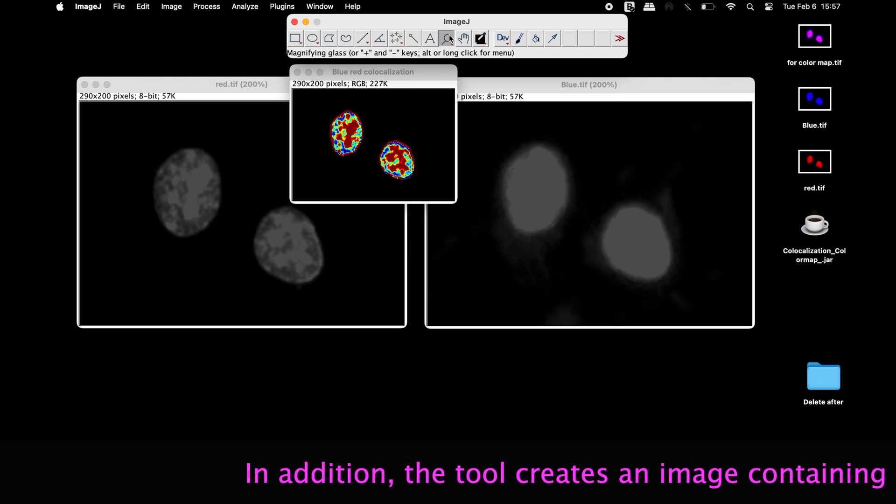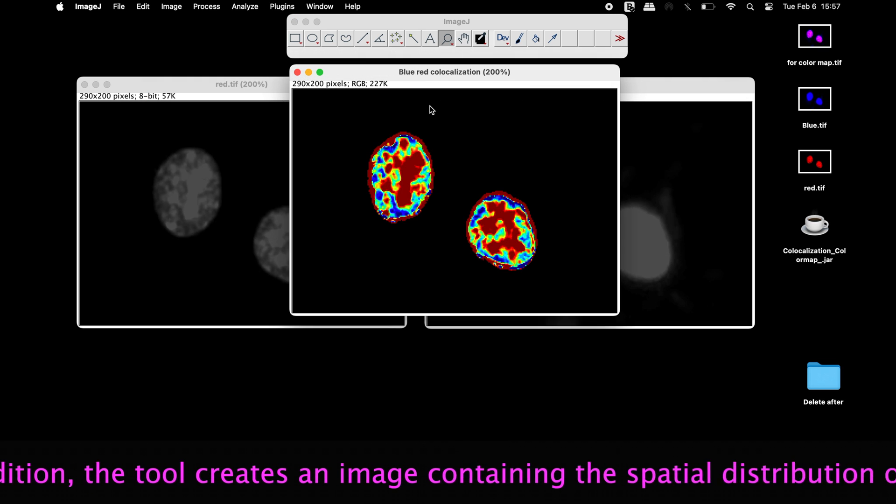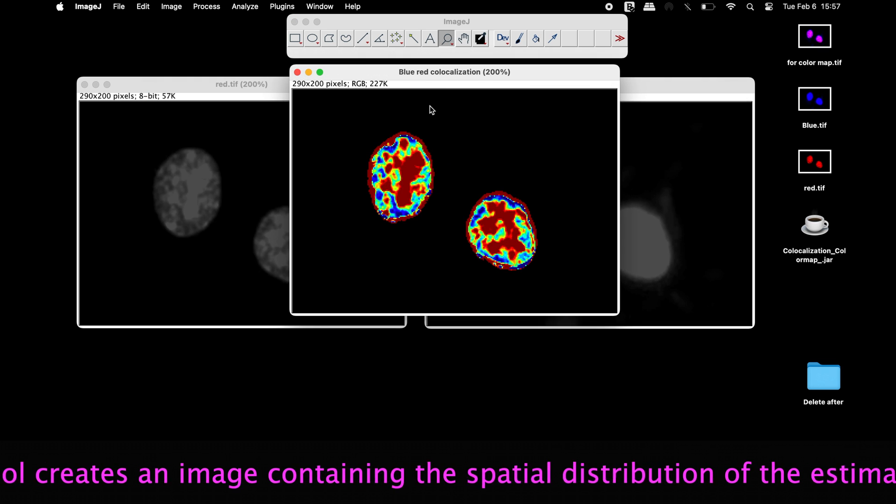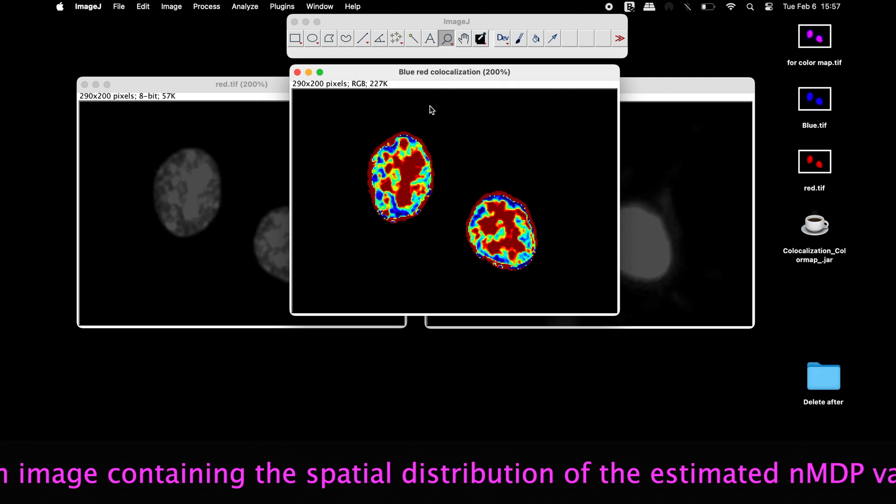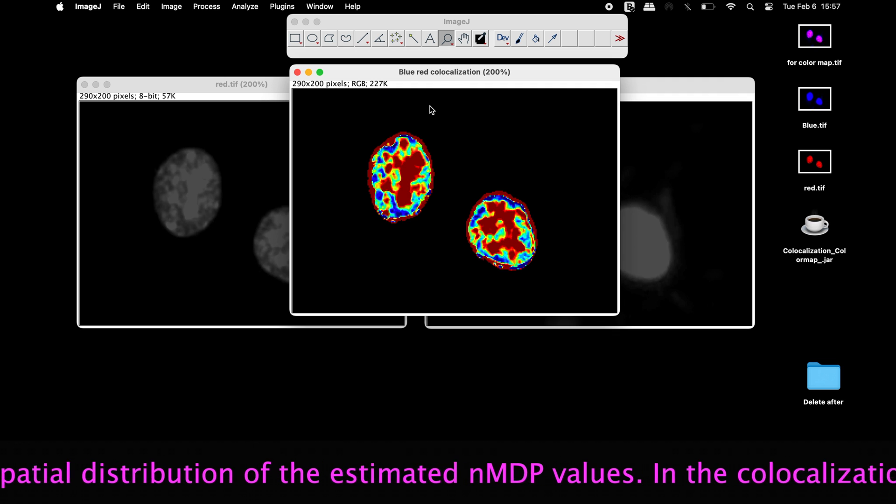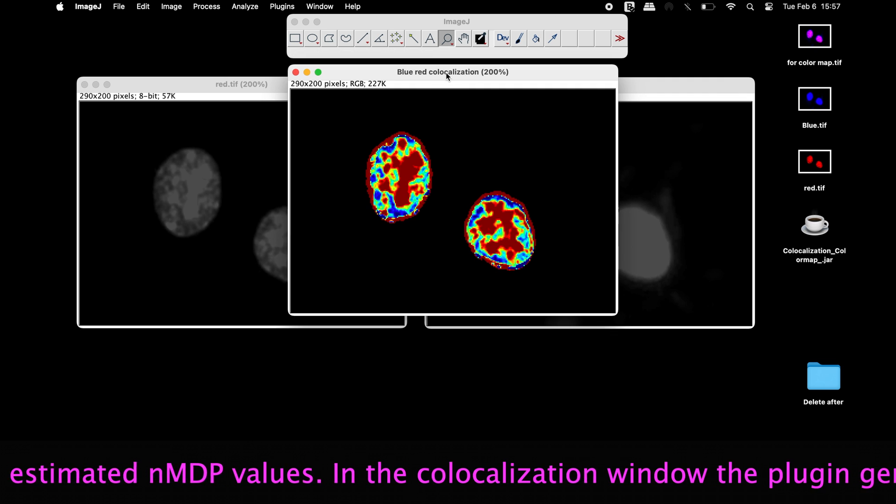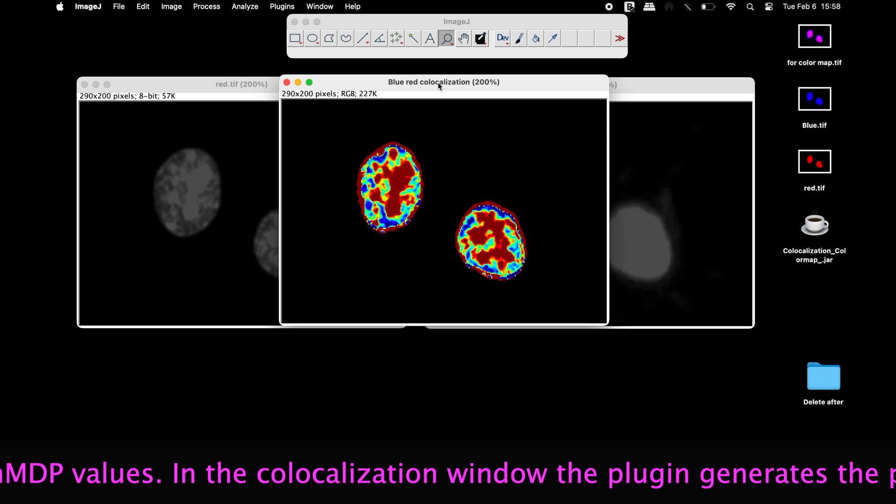In addition, the tool creates an image containing the spatial distribution of the estimated normalized mean deviation product values.